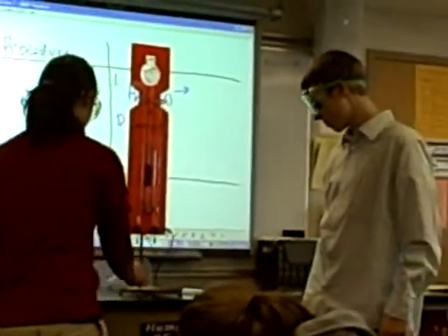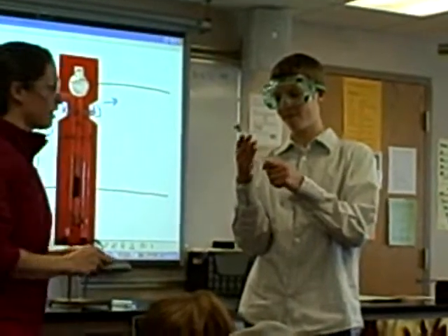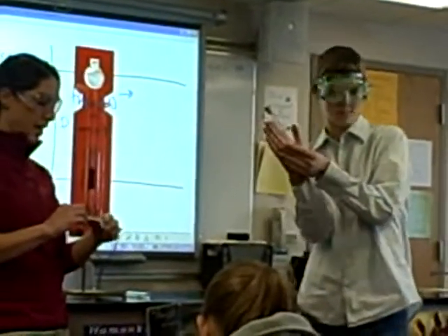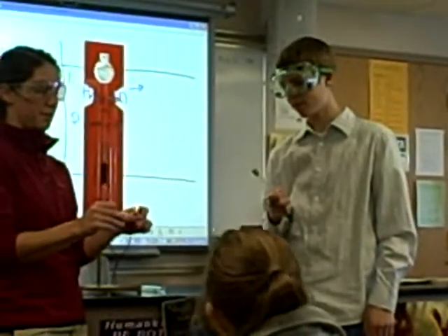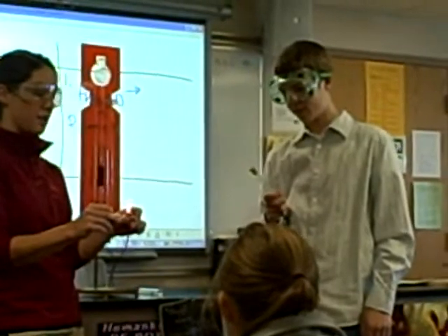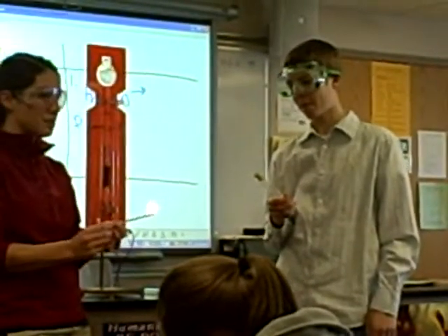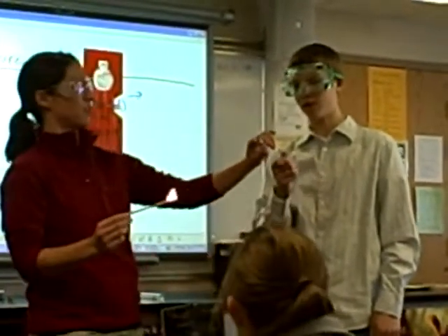so be prepared for that. Okay, oxygen. We're going to use a glowing splint, so I'm going to let it burn a little bit, blow it out, and put it in there. What do we predict will happen? Start on fire. It sometimes does, sometimes doesn't. It might just glow brighter, so you might have to watch carefully. Let's make sure the label isn't there.